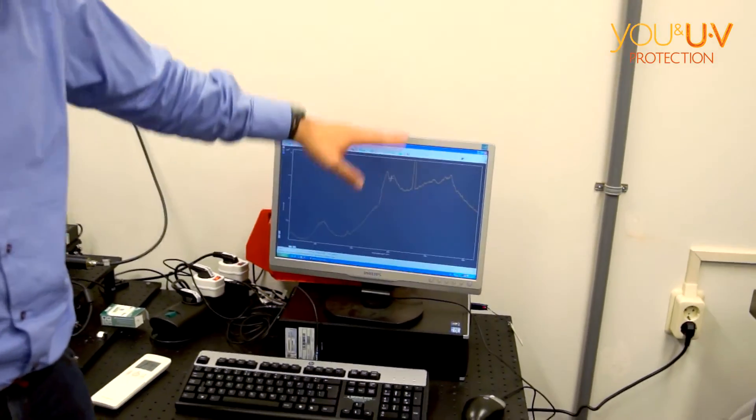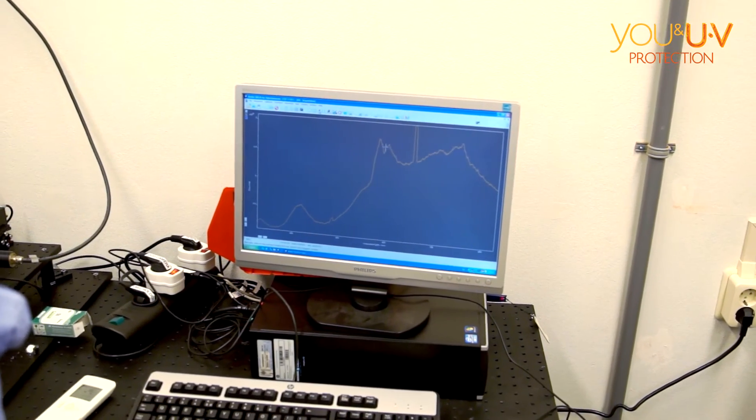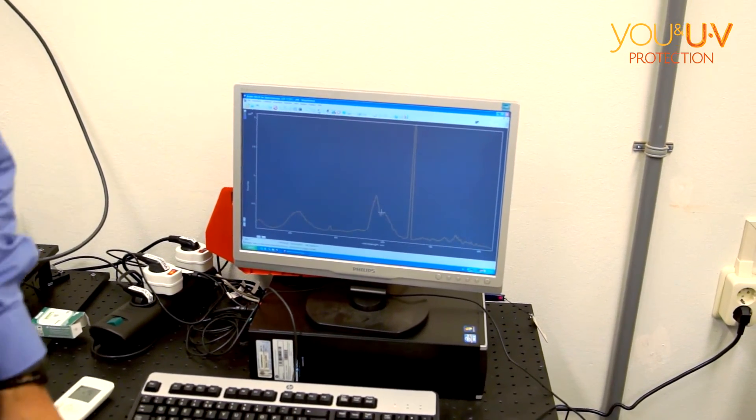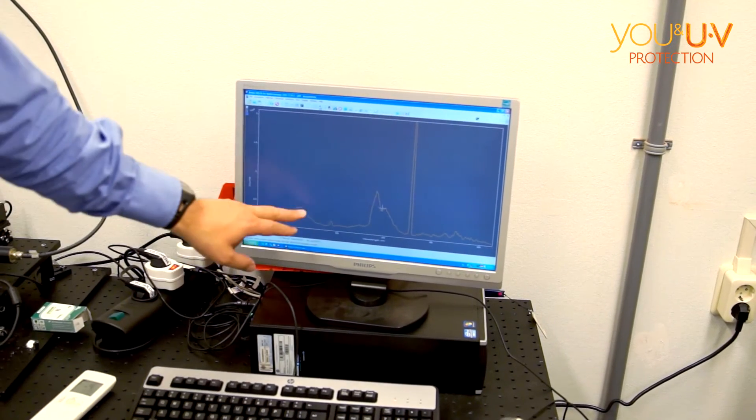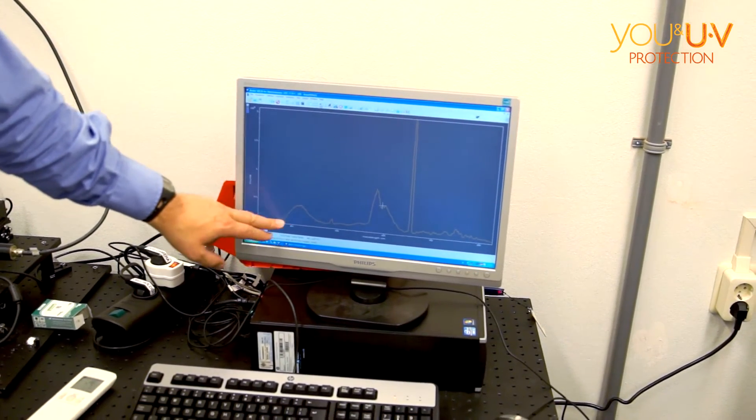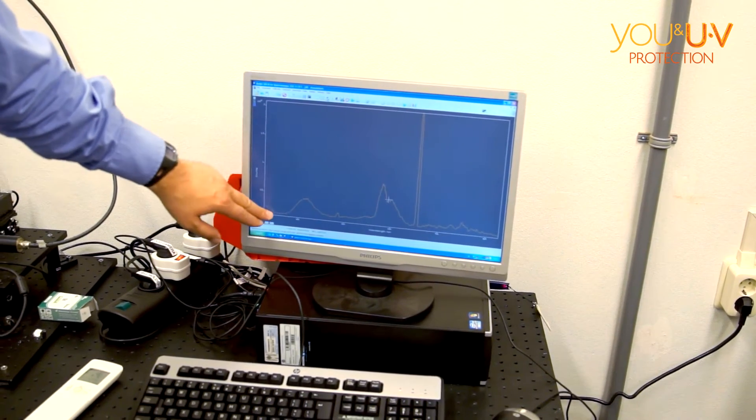It should appear in a few seconds. You see an overall increase, there's a very sharp line here which comes from deuterium. If I turn off the tungsten lamp, this is the deuterium emission spectrum. We have not so much light around this region—that's just because this region is quite weak—but we have enough.